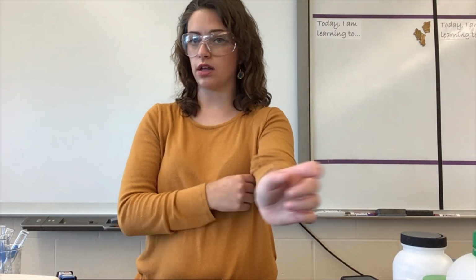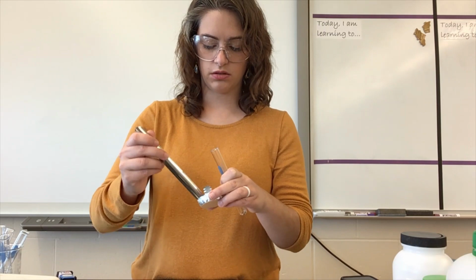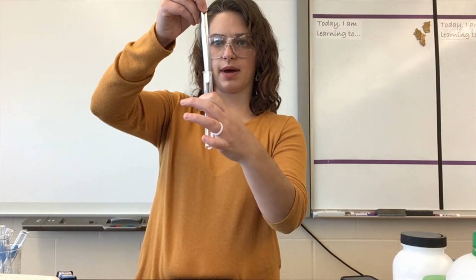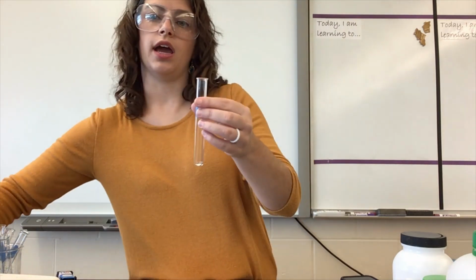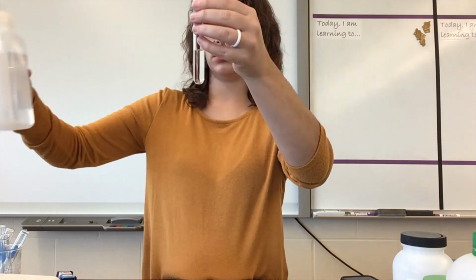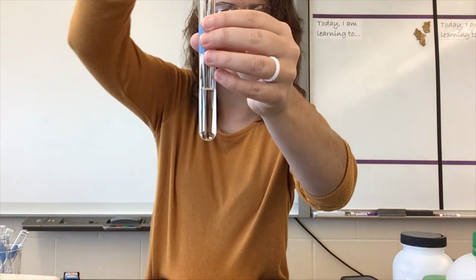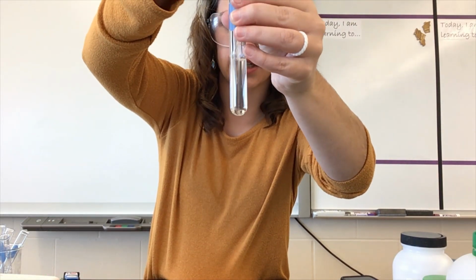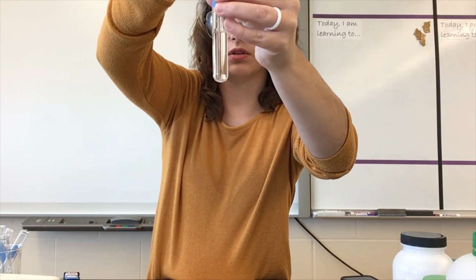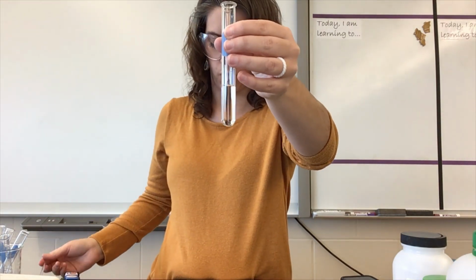Okay, so solubility first. Clean test tube. Take a small amount, pop it in the bottom. Add some water. Oh, that one I definitely don't even need to stir. But just for consistency, and because our procedure technically tells us to, give it a stir. It is definitely soluble. There is nothing left. So potassium iodide is for sure soluble in water.